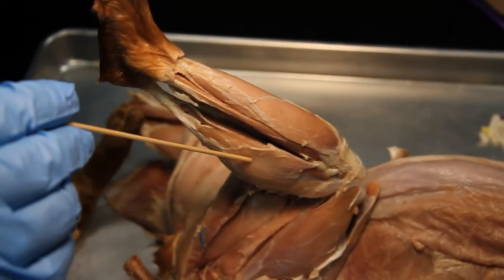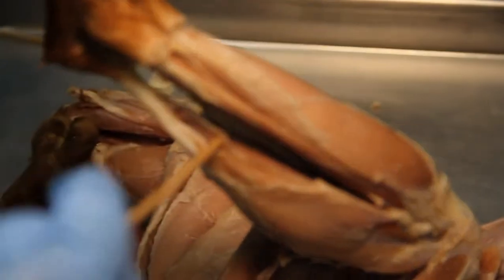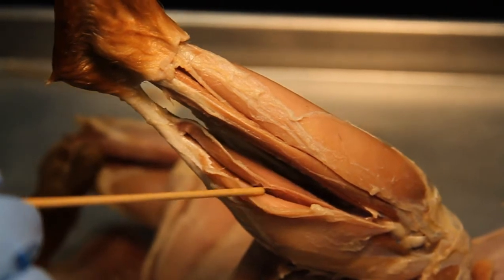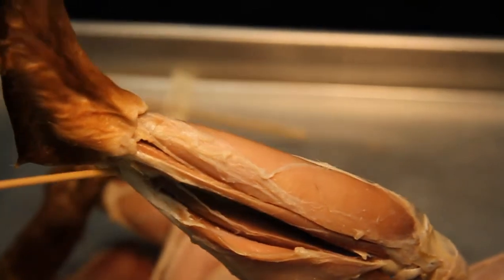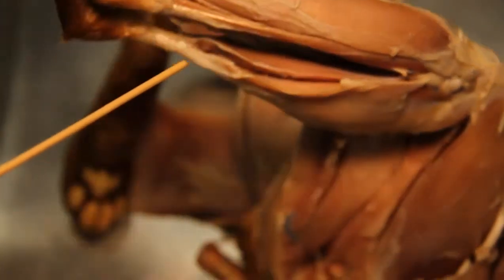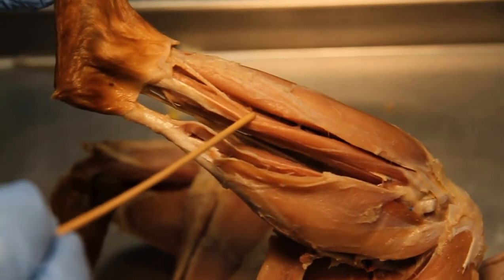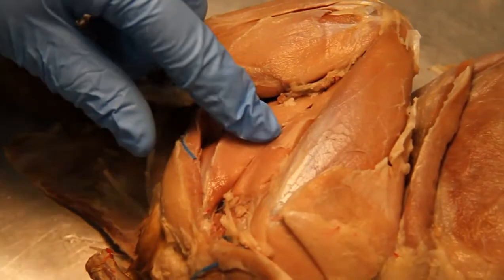Gastrocnemius. Soleus. Let's get in there. Calcaneal tendon, aka Achilles tendon. Tibialis anterior. Extensor digitorum longus. Fibularis.